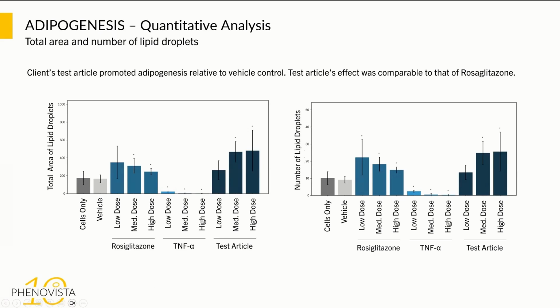So this staining with BODIPY, we've gotten a lot more asks about, especially in the CNS space. Of interest now to a lot of our clients is the role of lipids and lipid content in the CNS because it's becoming implicated also in contributing to the progression of neurodegenerative disorders, diseases. Accumulation of these lipids is associated with aging, inflammation, oxidative stress, which are all hallmarks of neurodegenerative diseases that we've known about for decades. So pretty interesting that we can take this one dye and apply it to so many different areas, different diseases, different cell types to answer different questions.